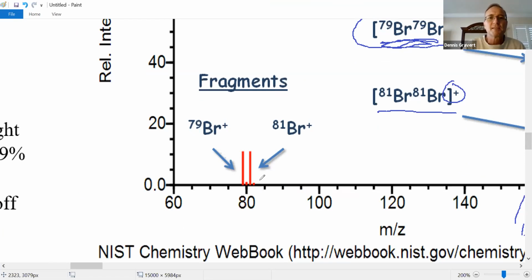You see two more pieces of data. Yeah, so there's two possibilities here. It could be that there's a little acid contaminating our sample, and a molecule of HBr that's a cation is making its way through.